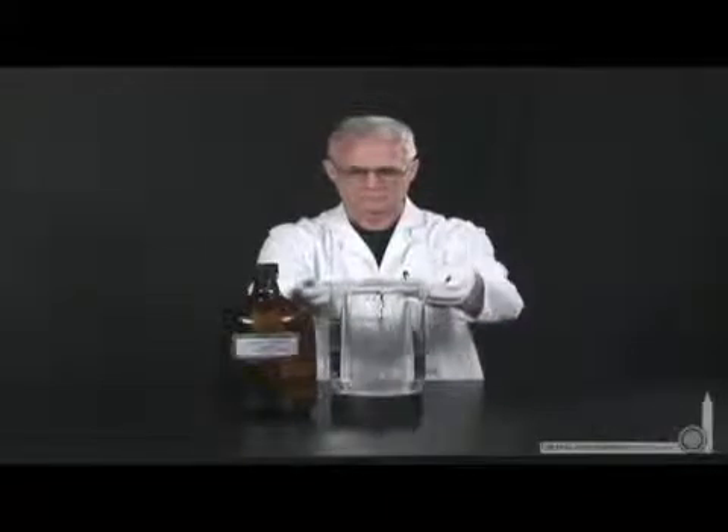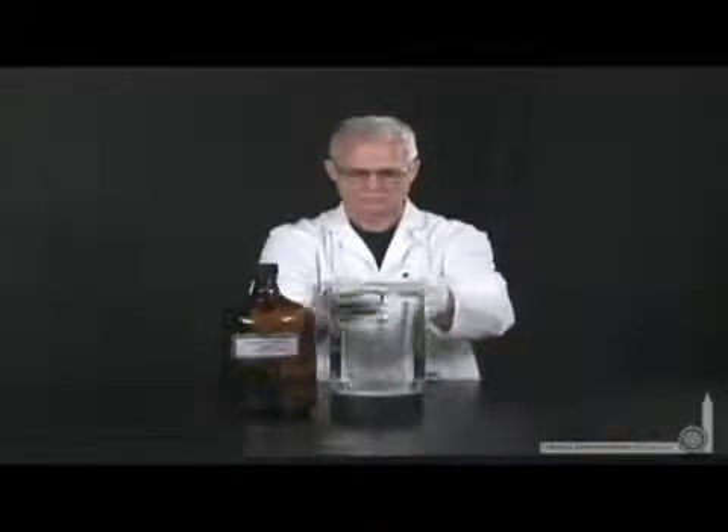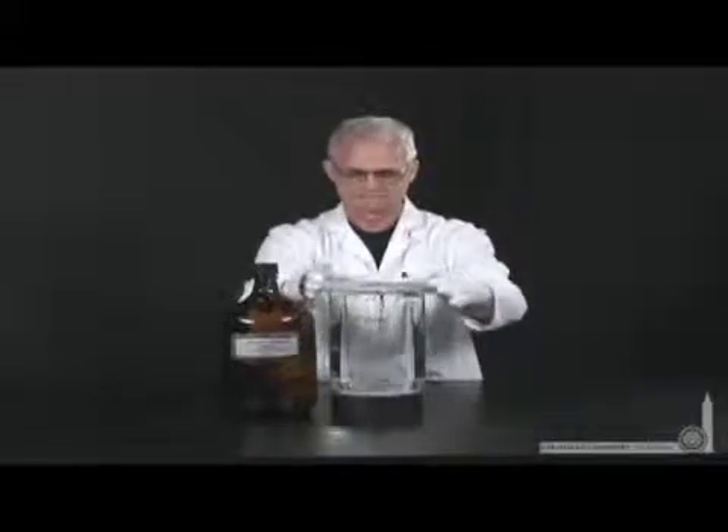The reaction actually takes quite a while. So Lani will seal it up and will do a time-lapse photography over the course of about eight hours to watch the silver metal form.